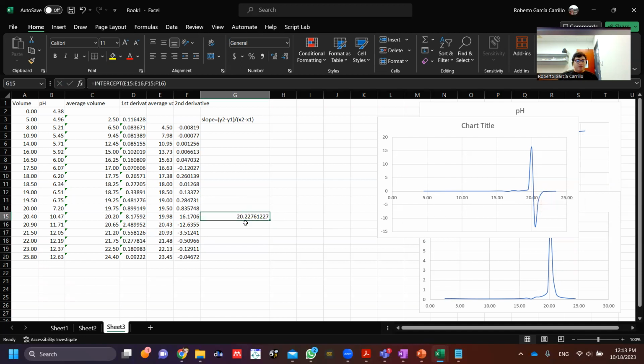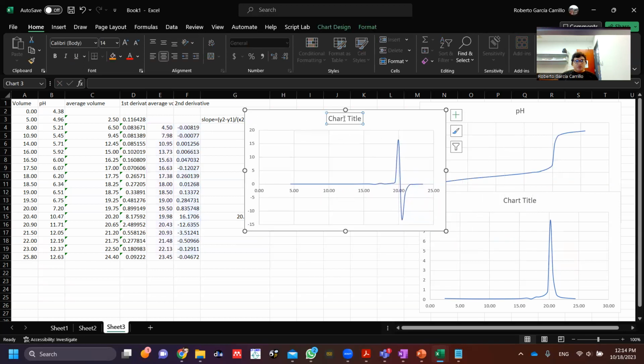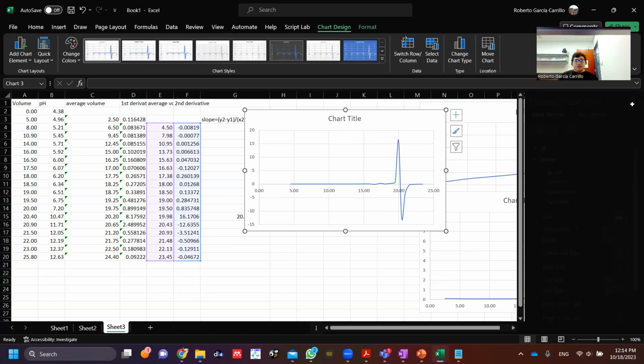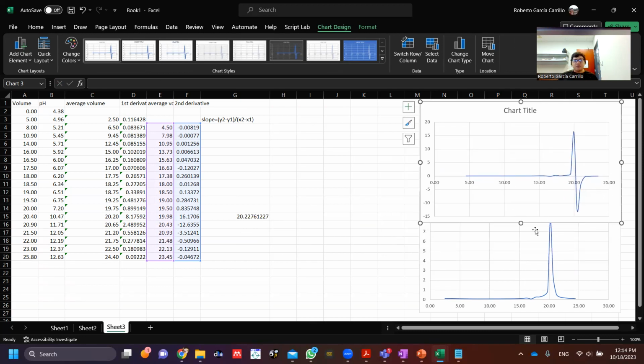And remember to always use only the appropriate significant figures according to the uncertainties from the burette. So be very careful of that. Also remember, when you show your plots, to show a proper title and the appropriate axis styles and everything else that I already taught you before.